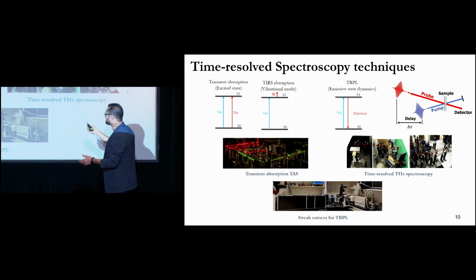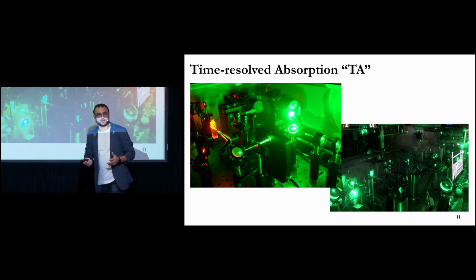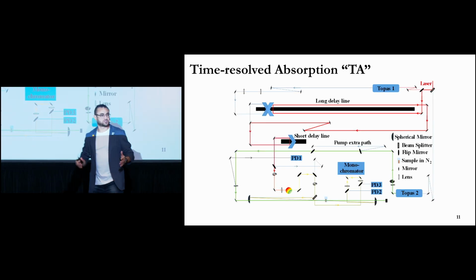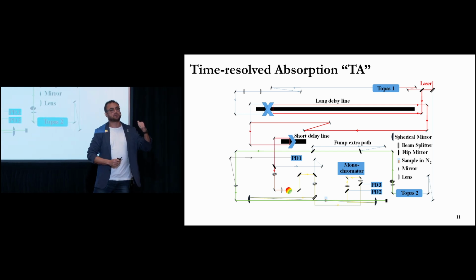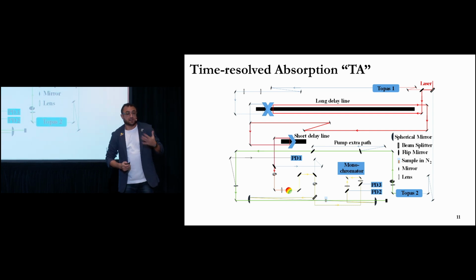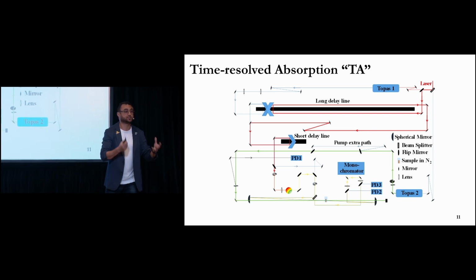And this is how the laser labs I work with look from inside. Of course, it looks really pretty, but when it comes to a real measurement, it is so hard, because you need to start from the laser at the beginning until you catch your sample, and you need to do all this kind of alignment. This technique is very powerful, and for me at least, I have learned from it what the challenges and bottlenecks are that we need to overcome in order to have an efficient solar harvesting system, as I will tell you in a while.